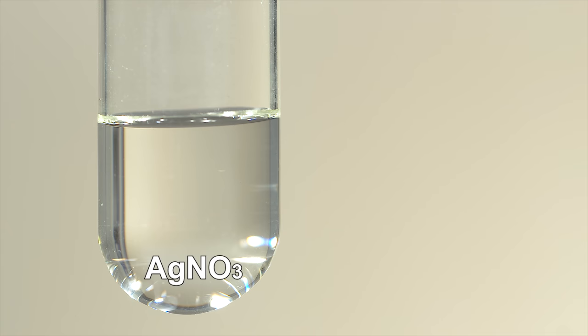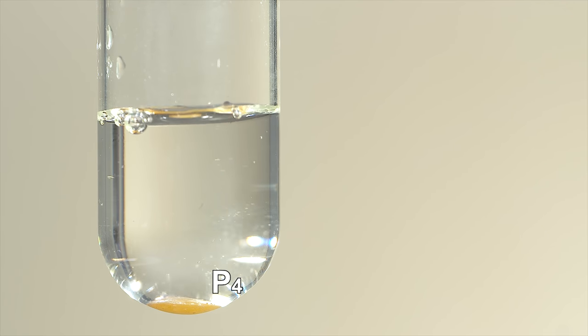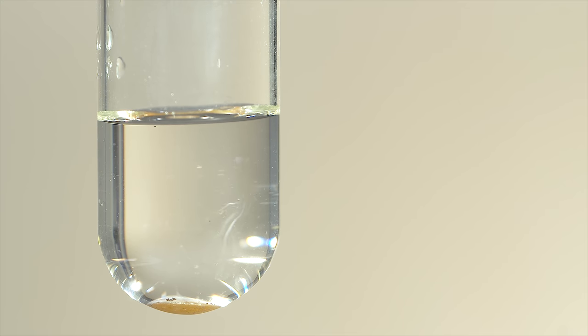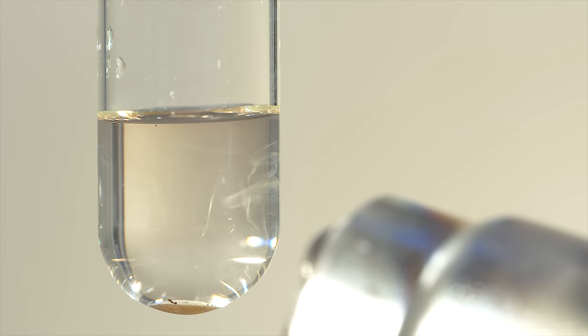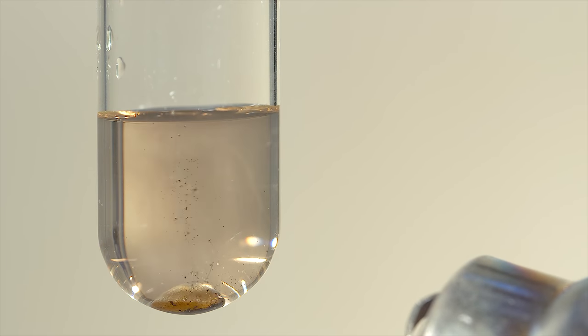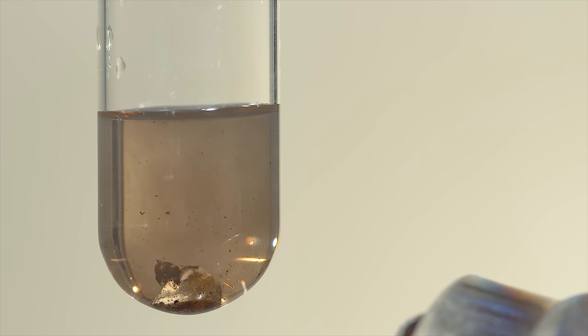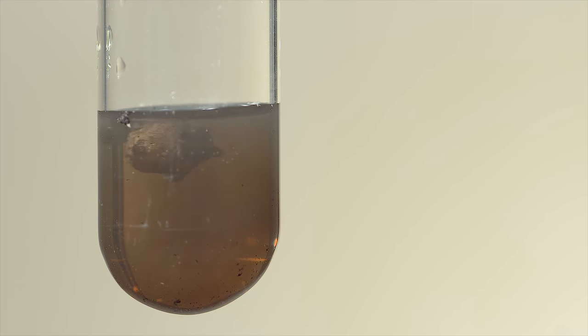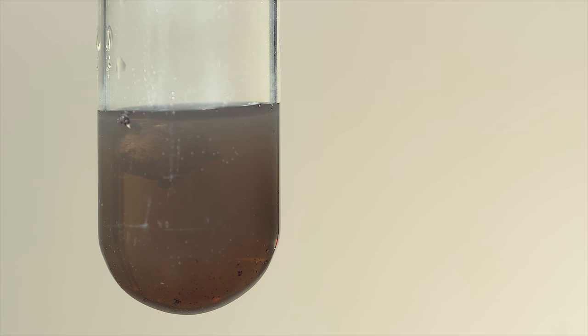White phosphorus can be decontaminated by a silver nitrate solution or a copper sulfate solution. The reaction with a silver nitrate solution causes the formation of silver on the surface of white phosphorus. It prevents white phosphorus from being oxidized by air.